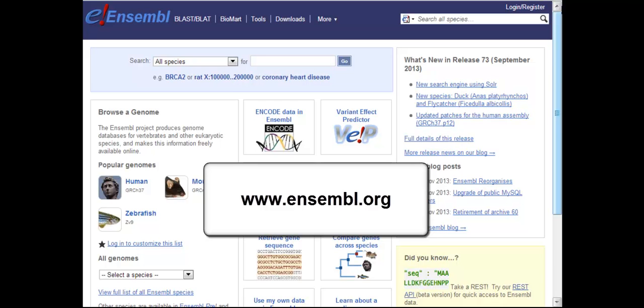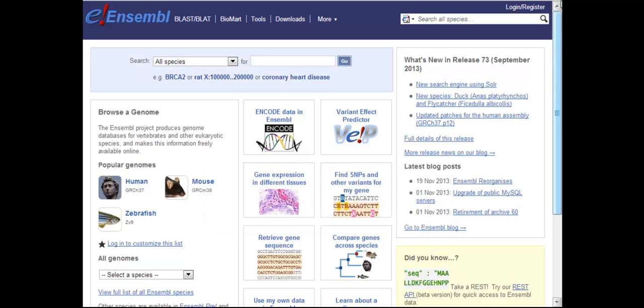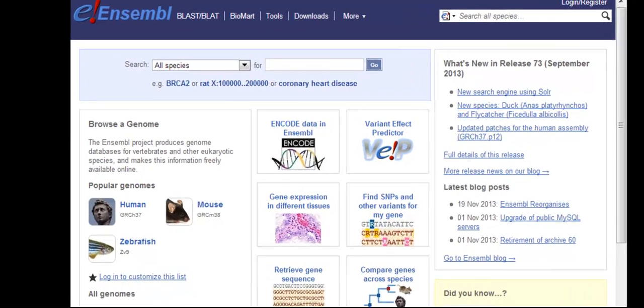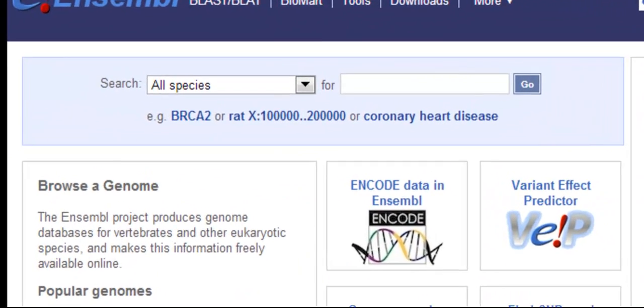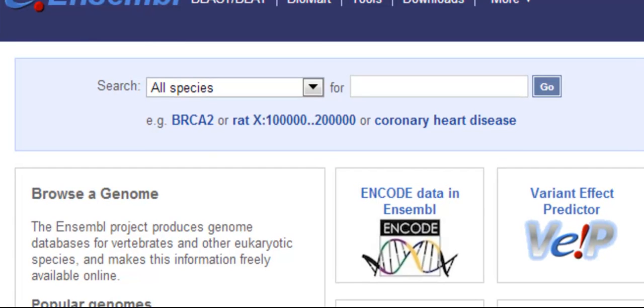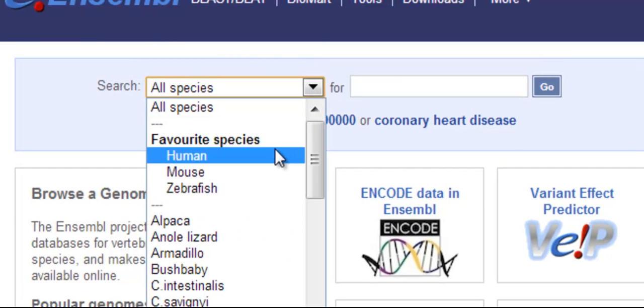Hi, I'm Julieta from the Ensembl Outreach team. I'm going to use the CFTR gene in human to demonstrate how to turn on RNA-seq data and gene regulation data using the matrix.